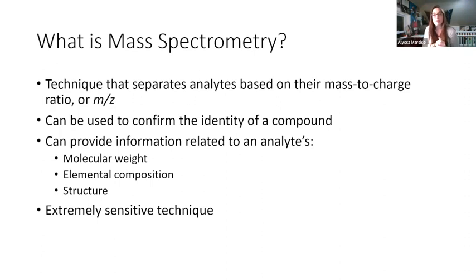Again, you guys should know this, but Mass Spec is used to uniquely identify a compound. We commonly say that the chemical compound's mass spectrum is a fingerprint of the sample, much like our fingerprints as humans are unique to us. A chemical compound's mass spectrum is unique to it. You'll never have the exact same mass spectrum if you analyze two different chemical compounds.